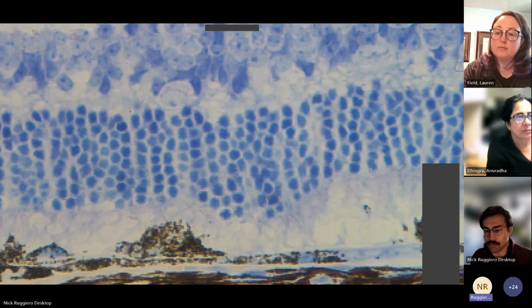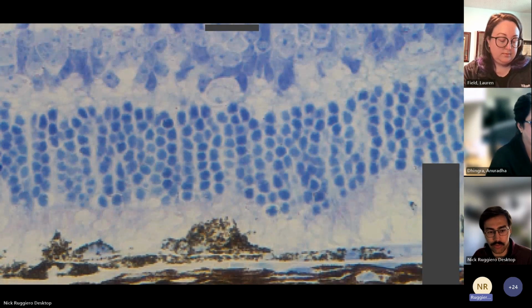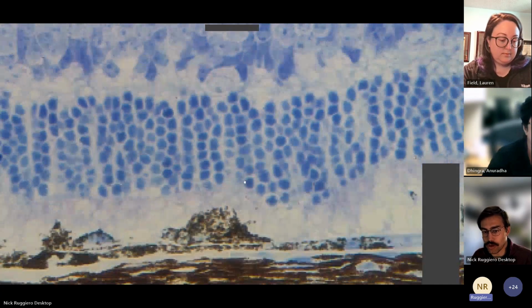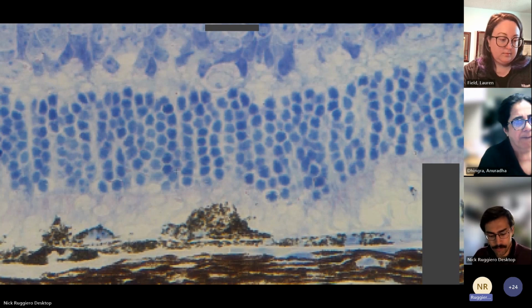We also have some really dark sections and some really dim nuclei of interest. I wasn't quite sure what exactly we did and didn't want to include here, for instance, really small objects in here, or if these 3 objects are actually one object. So that's something where you guys can probably go back and do some fine tuning yourself.